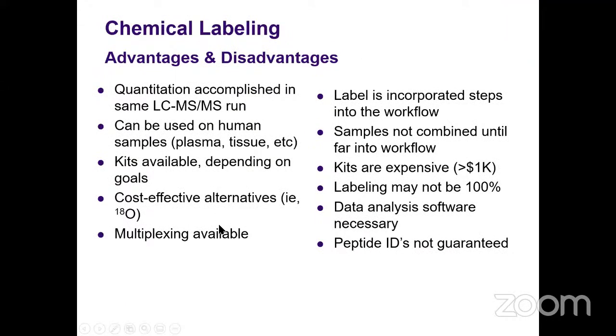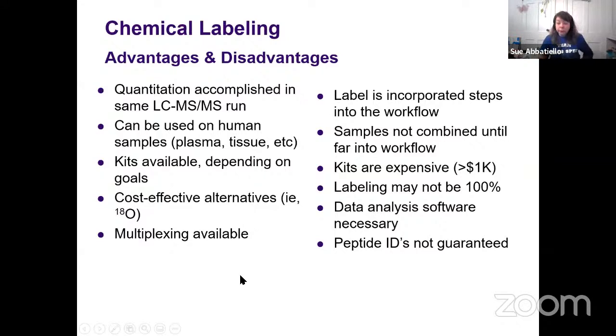Got a follow-up question on TMT. Is fractionation always necessary for TMT combined samples? So fractionation, which I haven't gotten into yet, is something that allows you to take your one sample and turn it into a lot of other samples. What it does is you take your sample, let's just say for argument's sake, you split it into 8 fractions.